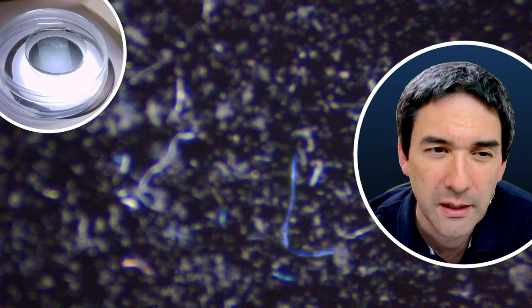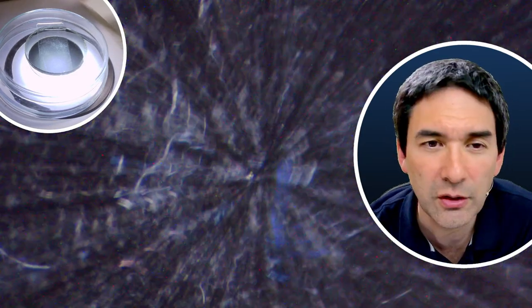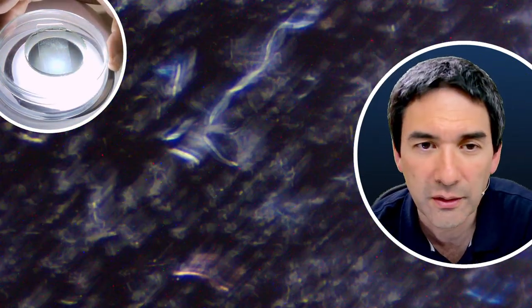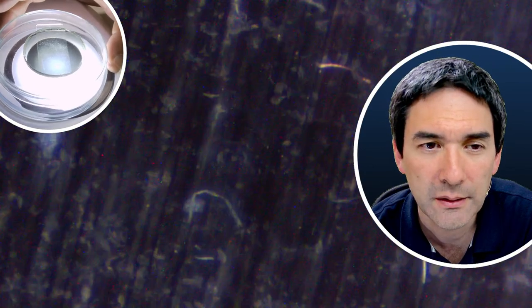So that's basically it, but some of the particles I see are relatively small. And I also have to say the following. Again, this is more a question of camera and not so much of the microscope. The image clarity is not very high. If I look through the microscope, I see a very, very crisp image. So it's a camera thing that I'm dealing with here. But again, all of those substances are depolarizing the light, and therefore they appear to be bright on a dark background. Okay.